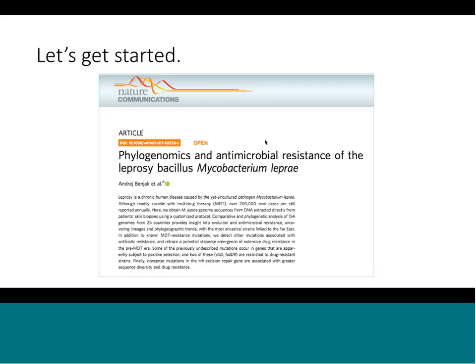It's a really interesting organism because it's undergone extensive genomic reduction, and they've dropped, compared to something like tuberculosis, which has 3,000 or 4,000 genes. Mycobacterium leprae generally has about 1,000, and it's highly pseudogenized. It divides very slowly. It's generally only in humans or in armadillos, so we're going to look at that, and we'll make some comparisons. We can't do anything as awesome as this Nature paper, but we'll look at differences that we can make in Mycobacterium leprae.